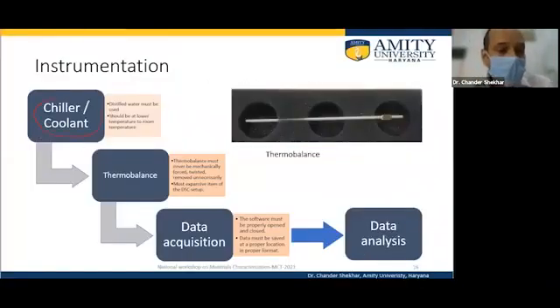The other component of the instrument is the coolant or the chiller. So the chiller basically, because we need to cool down the furnace from whatever high temperature we have subjected the samples to. So coolant is very important. Again, like the purge gas, coolant is also necessarily required to be flowing through the instrument all the time. The mass flow and coolant flow rate controllers are already built into the instrument. So like the gas, there is no need for controlling the flow rate of the coolant.